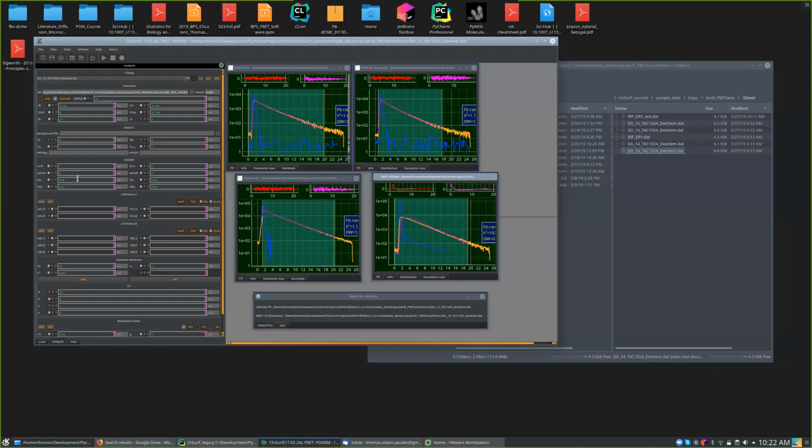Okay. As you have the excitation probabilities, or excitation prefactors, you have the same for the emission. For the acceptor, the emission of fluorophore B for this particular setting is 98%, and fluorophore A, which is the donor, is 2%. So what we have now is the acceptor channel.